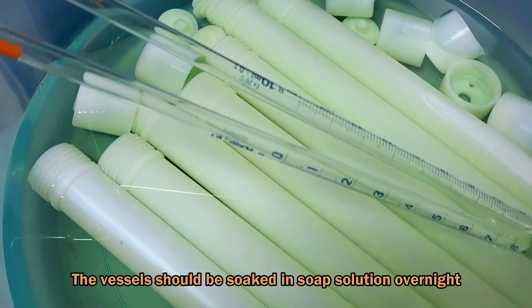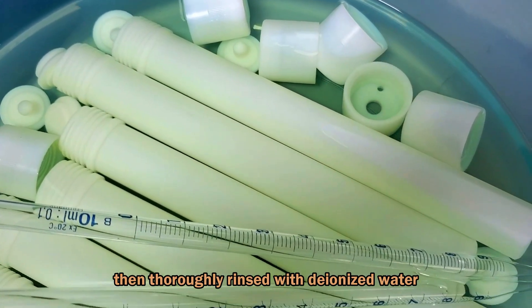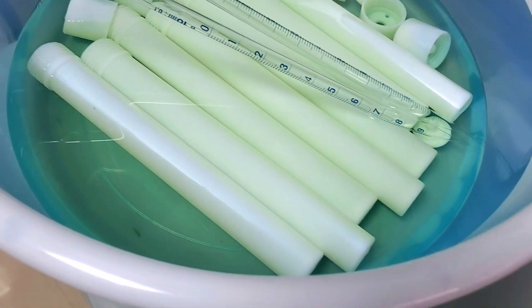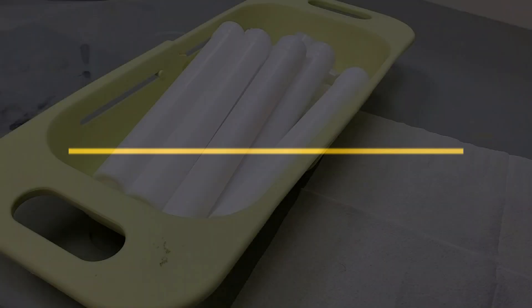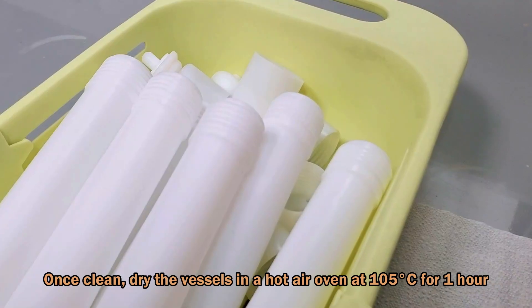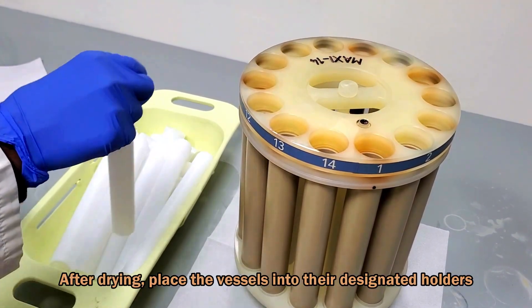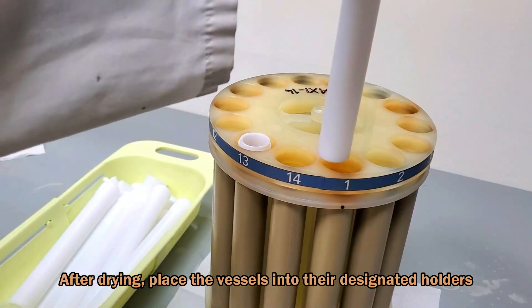The vessels should be soaked in a cleaning solution overnight, then thoroughly rinsed with deionized water. Once clean, dry them in a hot air oven at 105 degrees Celsius for one hour.